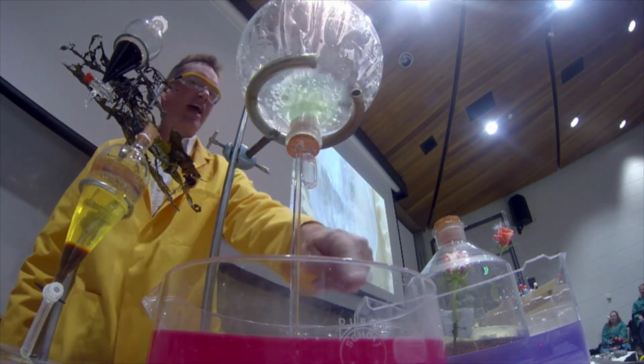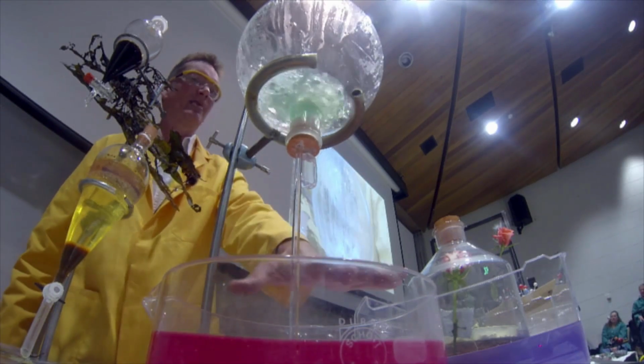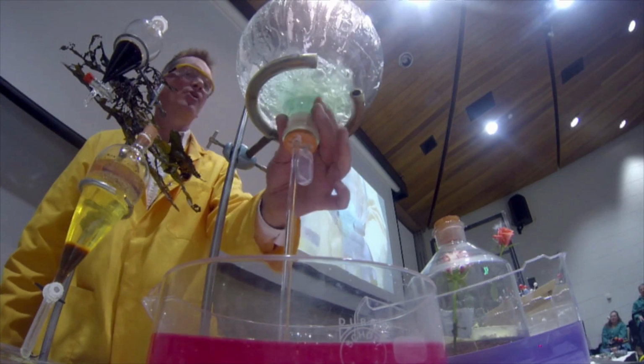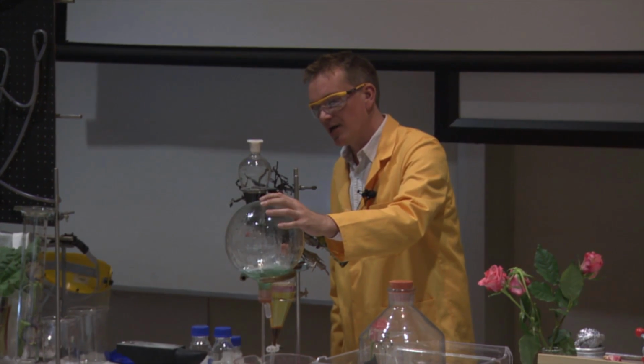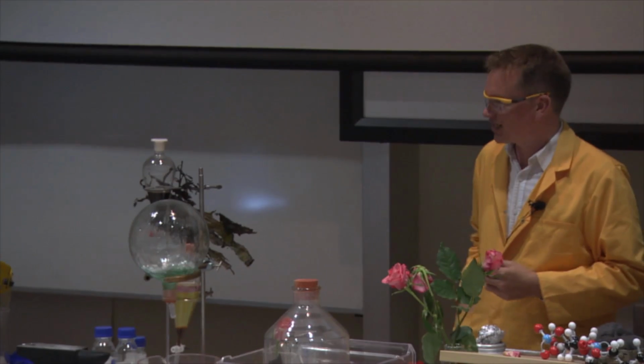But we've added some cabbage indicator here, and we've added a few drops of acid to make it red, but now it's reacting with the ammonia and it's changing green, okay? Showing again that the ammonia is not an acid. It's the opposite of an acid, it's an alkali, okay? So this is a rather beautiful experiment here. It's called the Ammonia Fountain, okay?